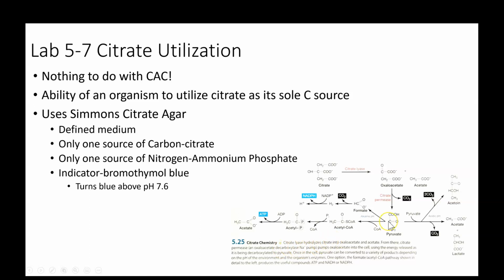So here's the pathway, the citrate chemistry. This is figure 5.25 of your lab manual. I'll talk a little bit more about this in the next slide. In fact, I probably should put this on the next slide, because I want to talk about the recipe first.